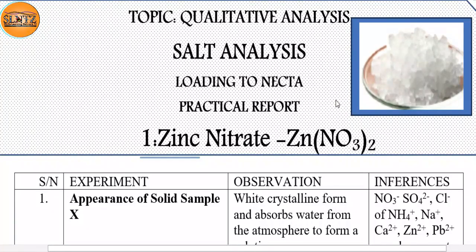So welcome to this lesson to know how to record a report and which steps we are going to follow. If you are a teacher, welcome to gain another concept. If you are willing to listen to this, I'm sure you are going to be fit in your chemistry practical lesson. For today we are going to start with zinc nitrate as a salt compound.